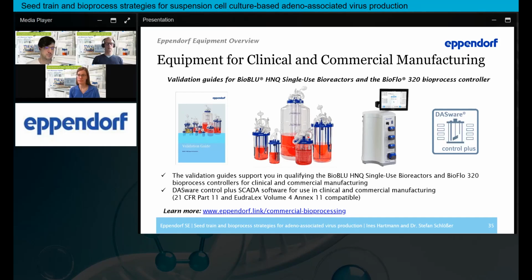It also enables you to compare your actual run with past runs, or compare past runs with each other. And it also offers some AI-supported tools for further, more detailed analysis. So this would be one of the recommendations if you want to watch what your cells are doing when you're not in the lab.